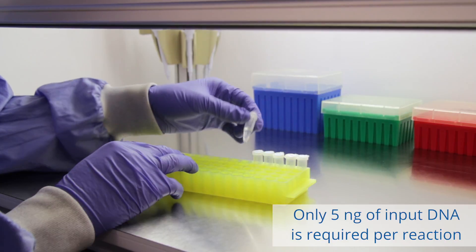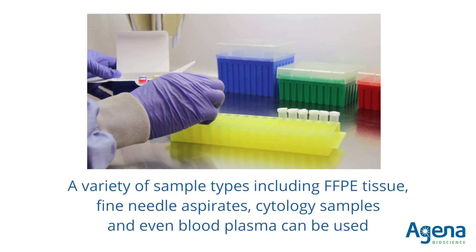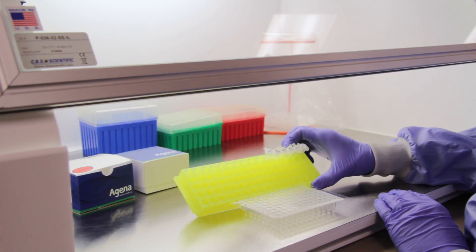Testing with the MassARRAY system begins with as little as 5 nanograms of extracted DNA per sample. DNA from FFPE tissue, fine needle aspirates, cytology samples, and even blood plasma can be utilized.